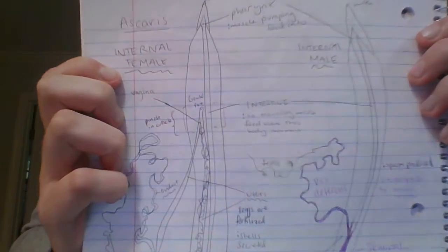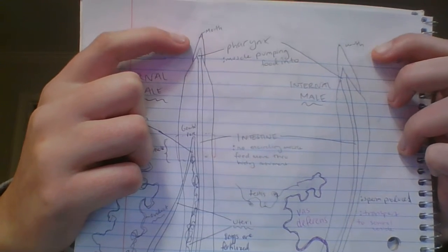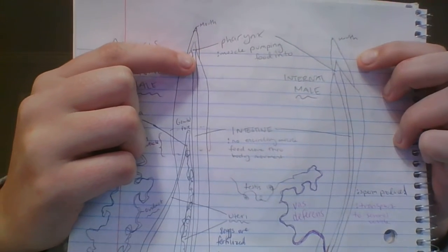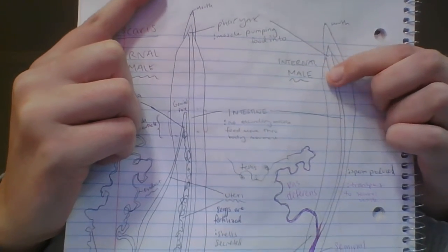Today I'm going to be doing an internal dissection or anatomy of the Ascaris specimen for male and female. Starting with common structures. This is the mouth anteriorly. It leads into the pharynx, which is a muscular organ that pumps the food into the intestine.